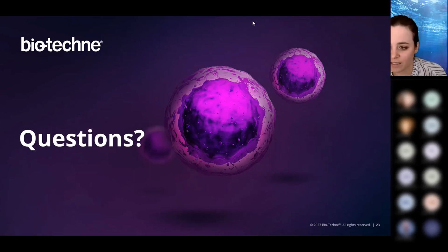We've got one in the chat. How does the protein normalization process interact with downstream antibody detection? So I know that the protein normalization reagent is put on before your immunoassay detection is performed. So we have not seen really any interactions that I know of, but I think it's always a good idea to include some sort of control in there, maybe one well without the protein normalization kit with your target, and then look at if there's any differences in that signal.